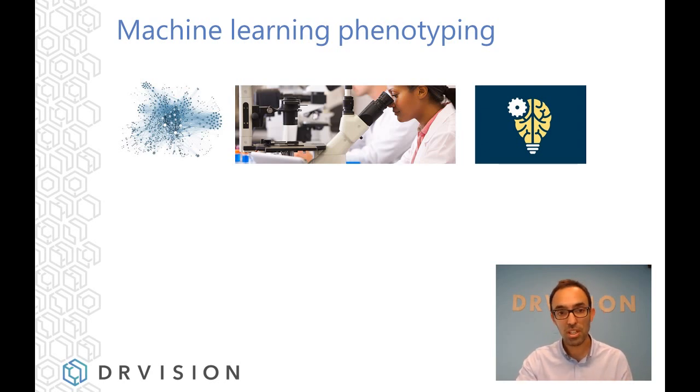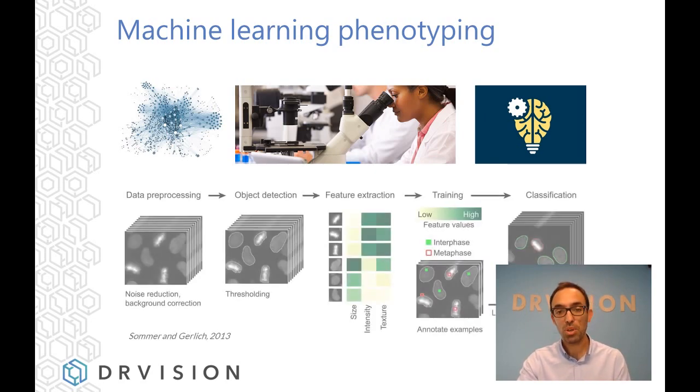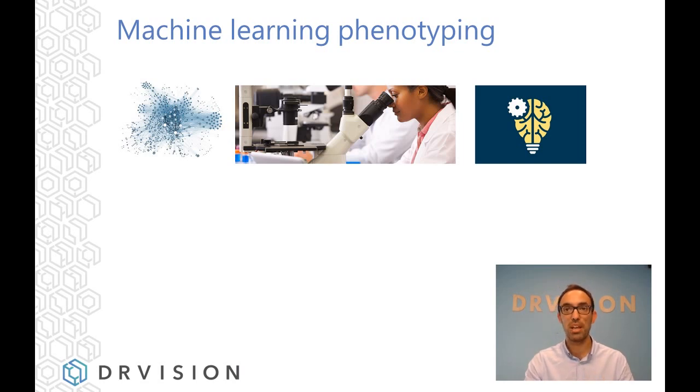But with machine learning, because it's automated, you can actually use all of the measurements that are extracted. It does require a little bit of work from an expert user, so that you can teach the algorithm which cells or which neurons are of a particular class, or which spines are of a particular class. But you can do that.